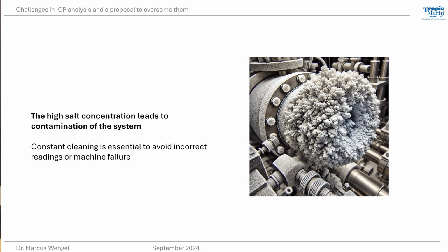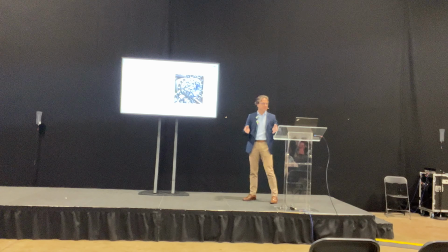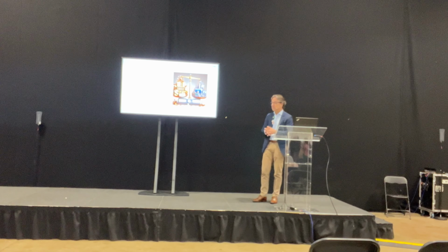So cleaning is one of the most important things, but everybody wants to get a sample very fast. Time is money, so we need to make clear that the systems get cleaned after each vial, after each measurement. So 50% of measuring is cleaning in the system.